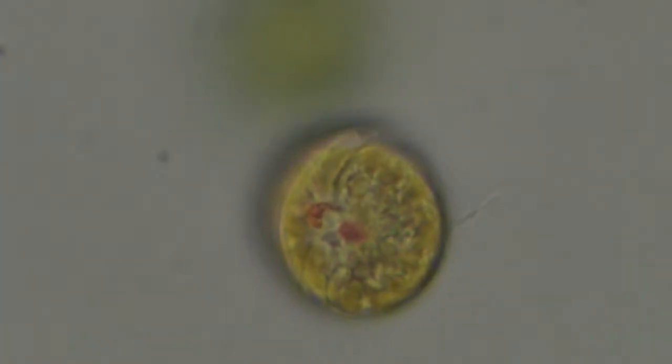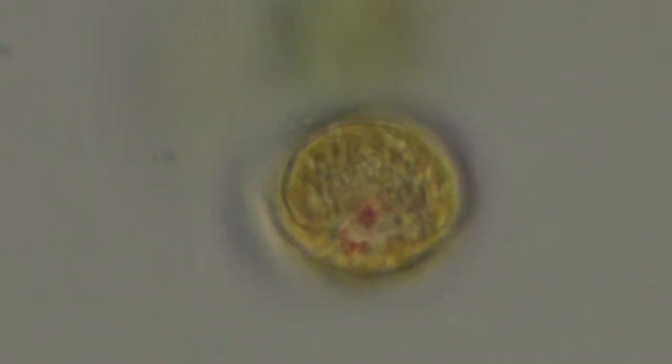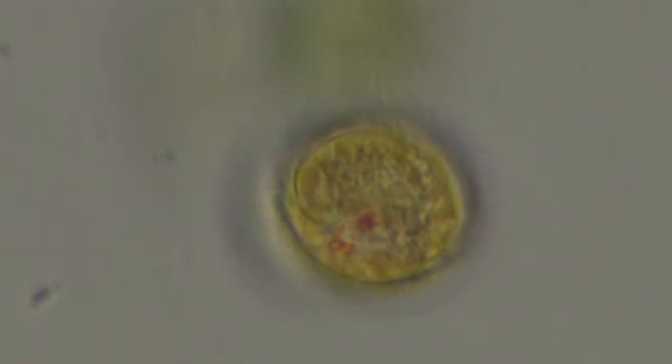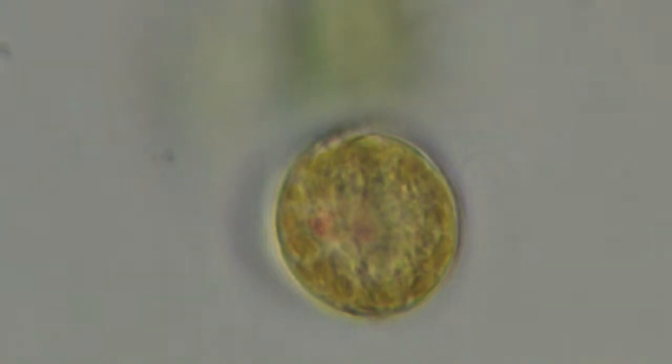Why is it not getting as much light as I want to get out of it? There we go. Much better. I can also crank this up a tad in the software. There we go, a little more light. Just don't want to lose the contrast. If I get too much light, it gets all flat looking. So yeah, there you go.